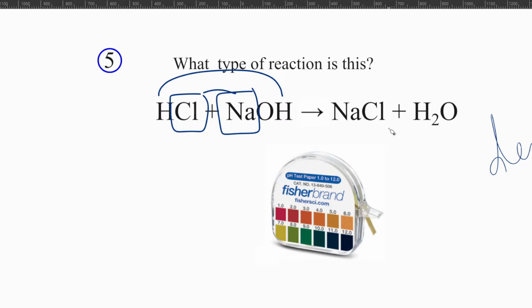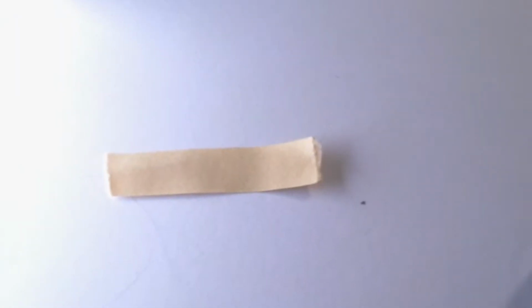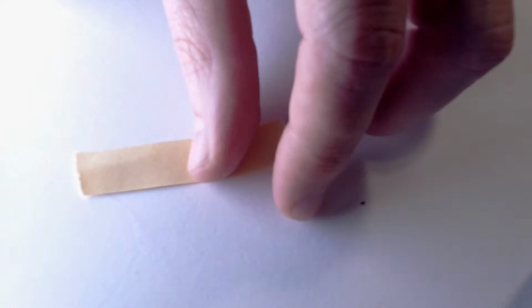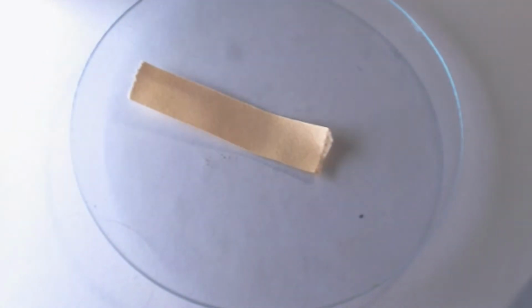All right, let's go over to my camera. We should probably put it in a watch glass because these are pretty strong. I have a strong acid and a strong base. And I'm going to put some face protection on as well so I don't burn my face off. Could you imagine if I ran from the room screaming? What would you think?